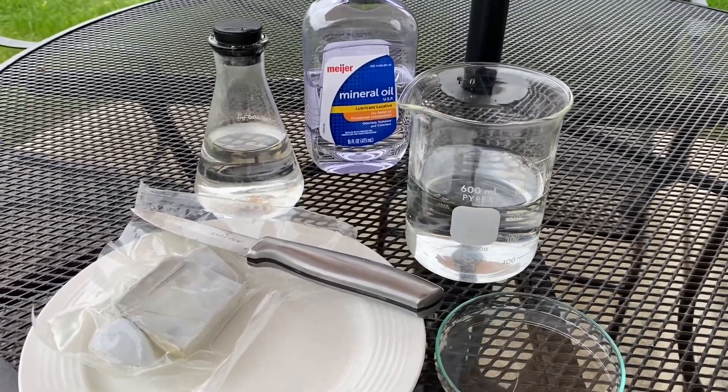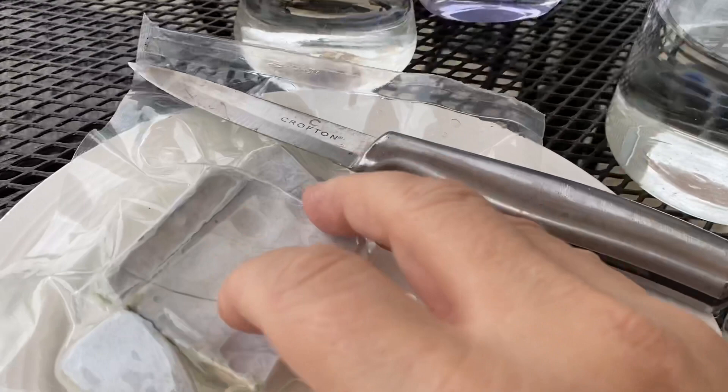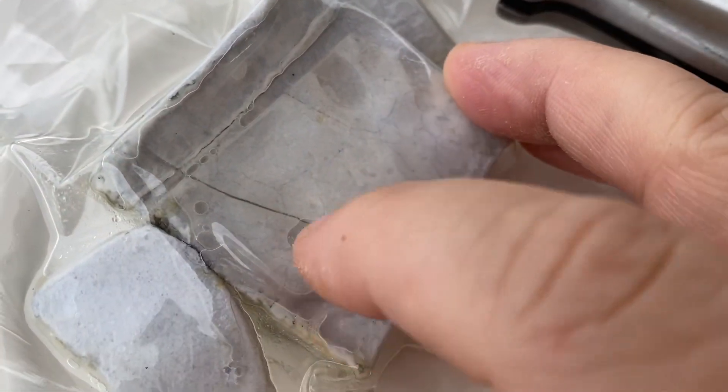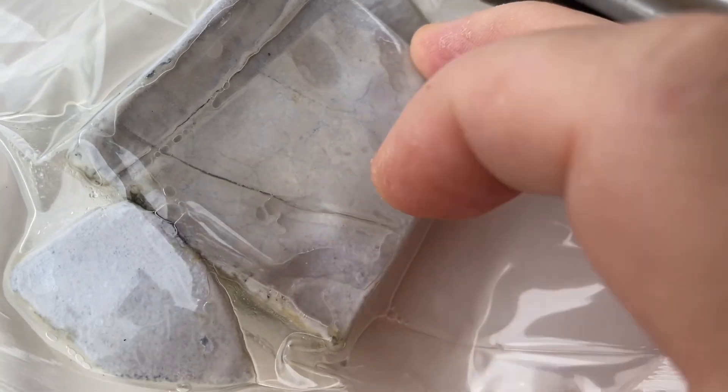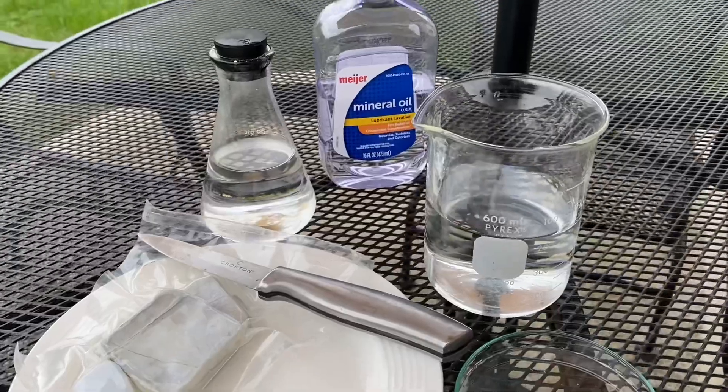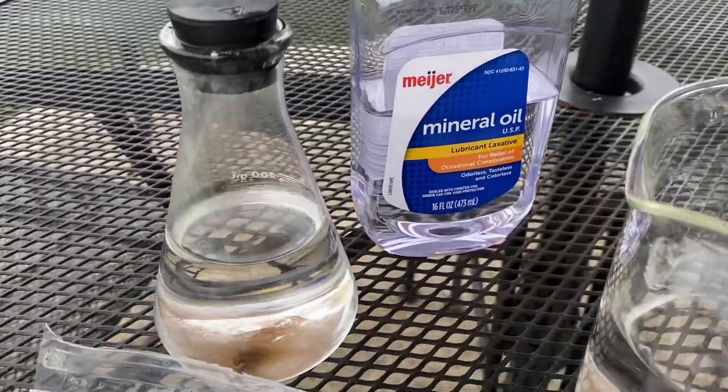Welcome back to Ramsey Land. Today we're gonna find out what happens when you put pure potassium metal in water. Potassium is an interesting metal — it's very soft. You can press on it and actually dent it with your finger. It's very reactive with water and even moisture in the air, so you wanna make sure that you store it in mineral oil.